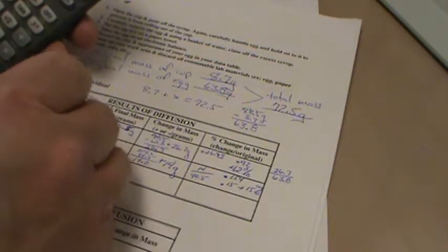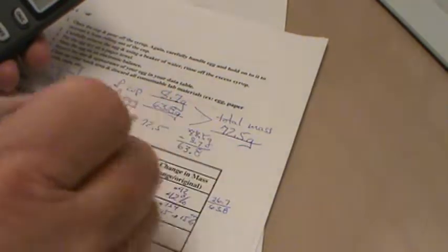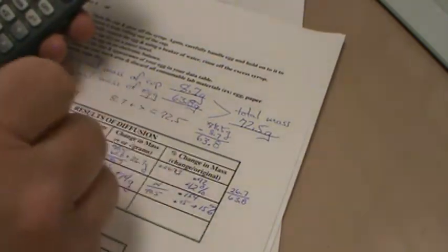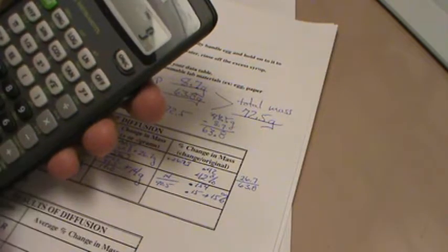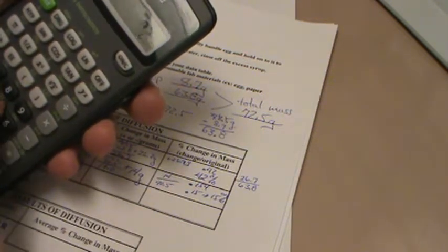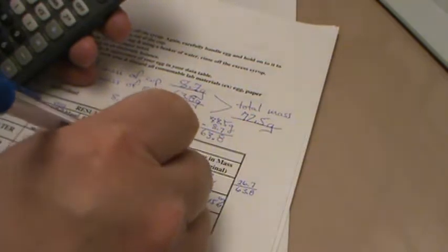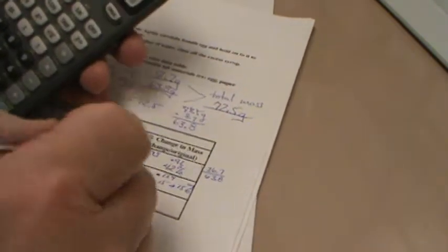Now let me go back up here and check this. Let me take this 63.8 out, and we'll start with the mass of the cup and the egg, since we're using it as a unit. That was 72.5 to 90.5. So 90.5 minus 72.5 is 18. So not quite the significant increase that we thought. 18 grams changed.